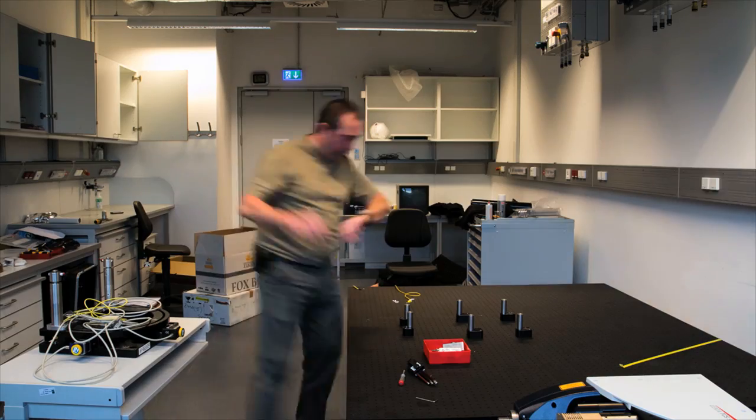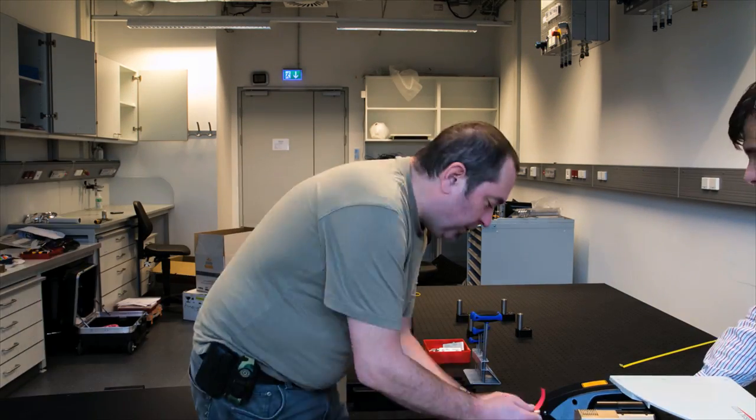Now the setup has been taken apart, which took approximately one day of work.